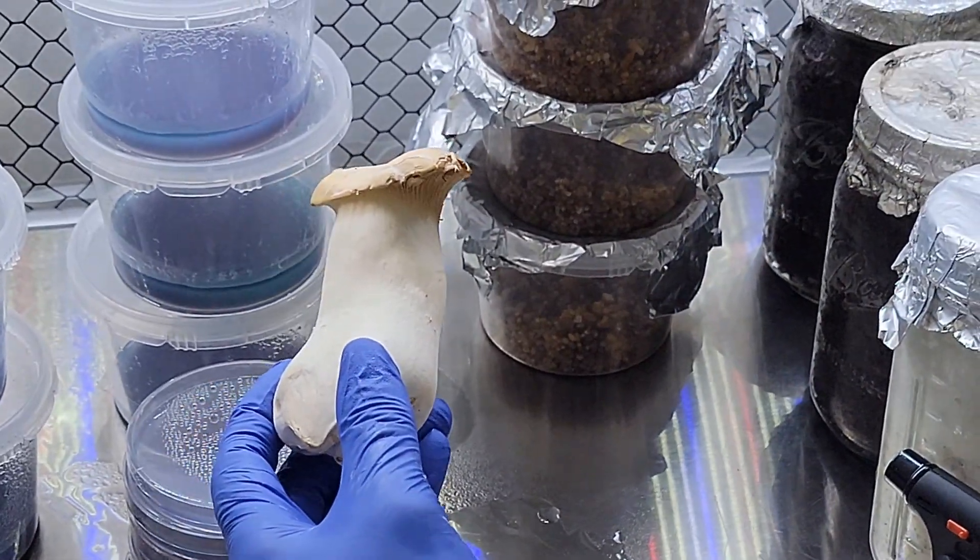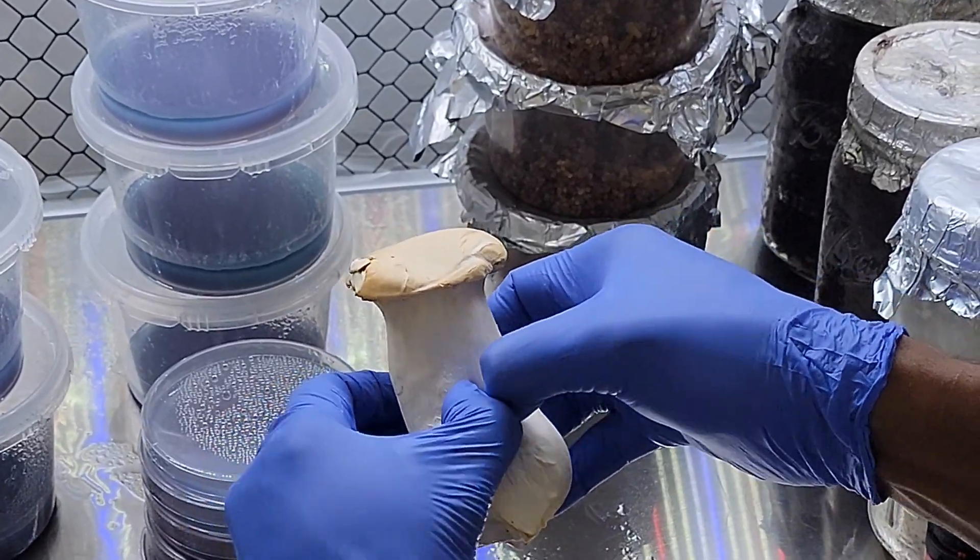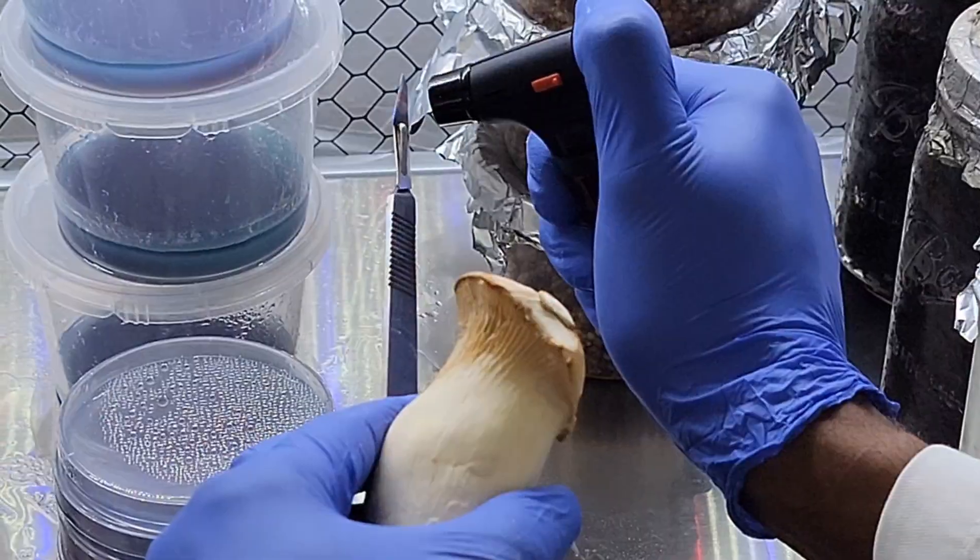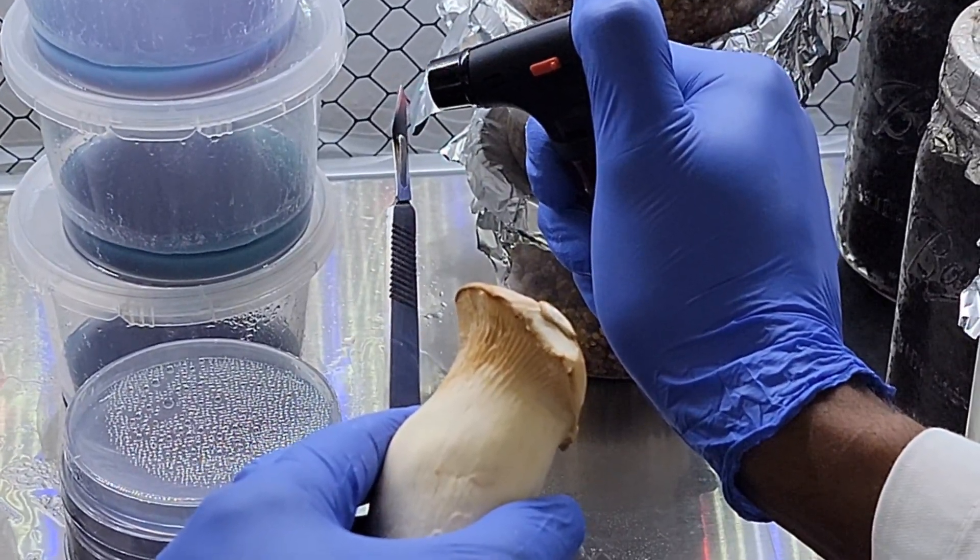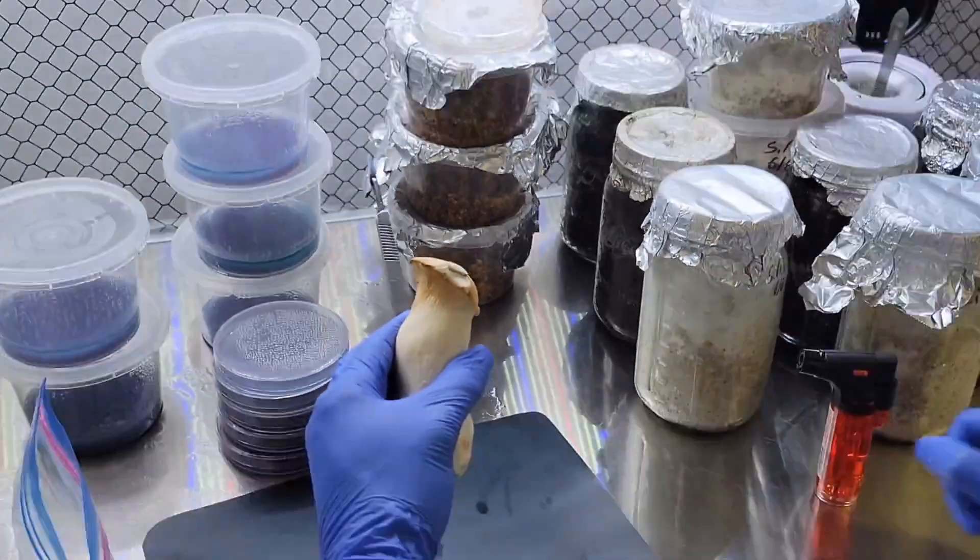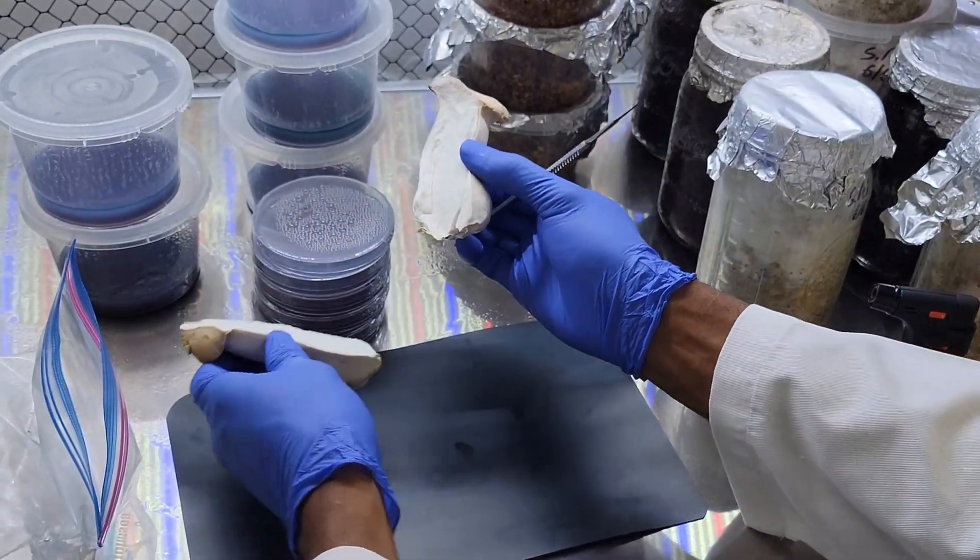So the key thing about cloning a mushroom that you want to remember, especially if you plan on cloning any wild specimen, is that you should always take your samples from the inside of the mushroom. The reason we do this is because contamination exists in the open air and on all surfaces, but on the inside of the mushroom none of that really exists - it's only the mushroom inside.